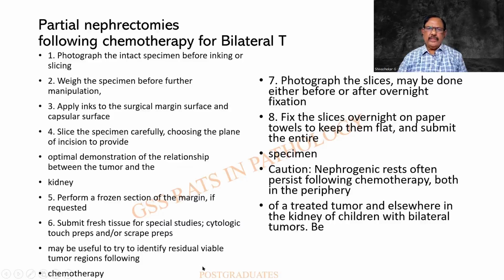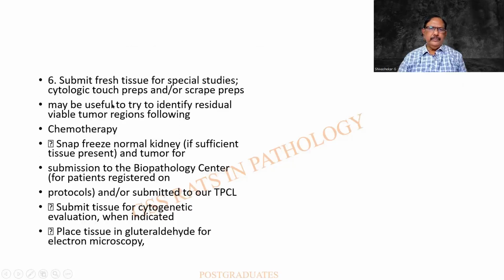So these are the various things. And apart from other things, you will have to look for the nephrogenic rests that might persist even after chemotherapy. The weight, slicing, other things are all almost the same. Photography, etc. For special studies, you will have to do sometimes touch preparations and scrape preparations. And after chemotherapy, you will have to either do the snap freeze of the normal kidney if sufficient tissue is present.